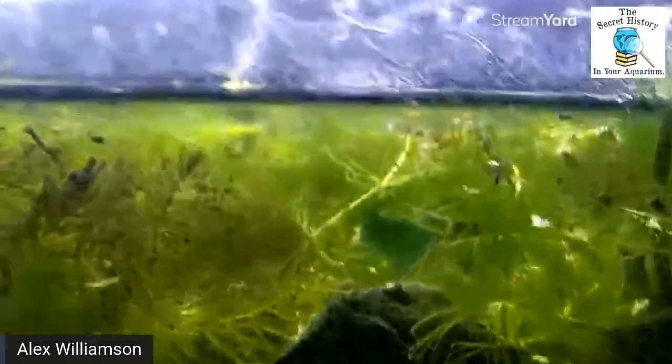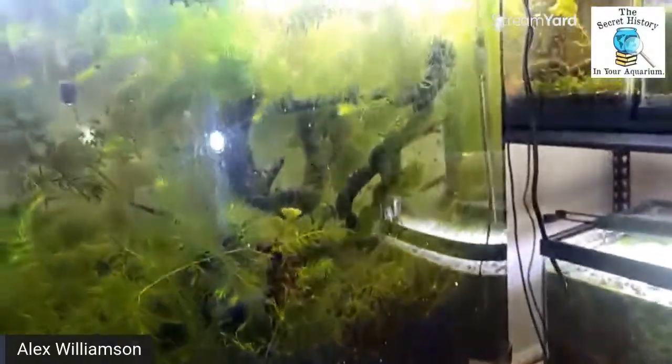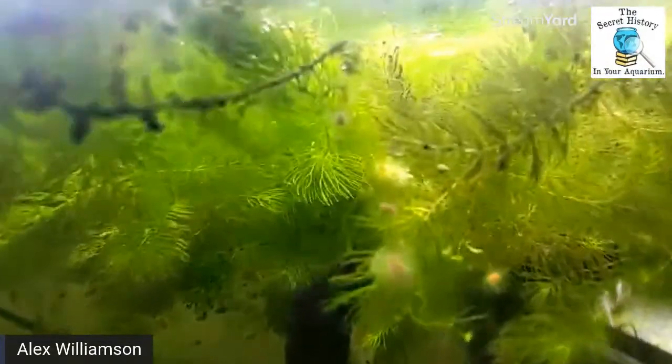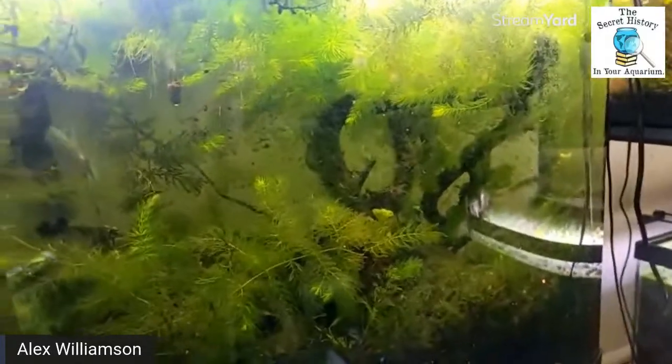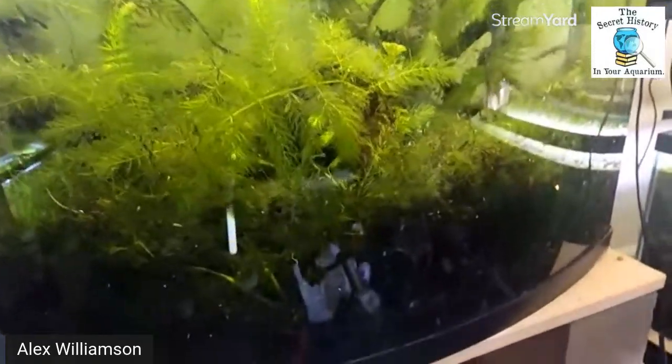And then we have this one, which is covered in mulm and algae because I put rift lake cichlids. Well, actually, these are Lake Victorian, so not technically rift lakes, but I put a bunch of cichlids in here with plants, and that never, ever, ever works. But they do have some moldy food in here from yesterday that I just noticed when I was cleaning through the algae. And we could look at what fungi blooms look like under the microscope, too.